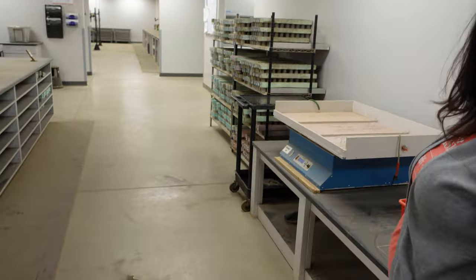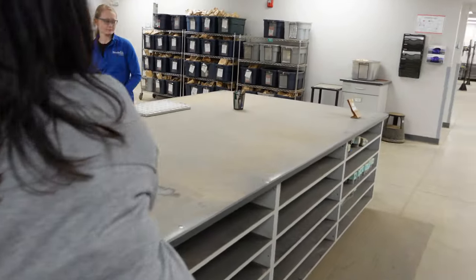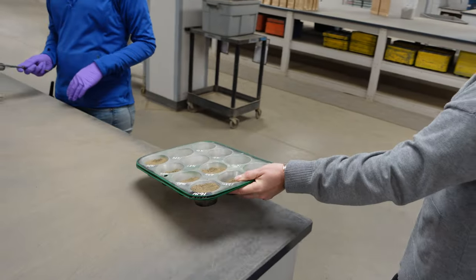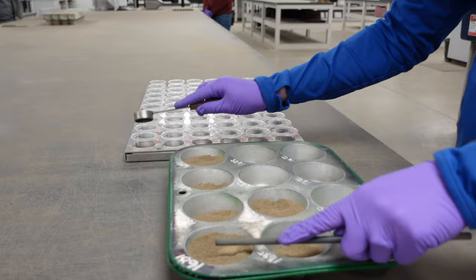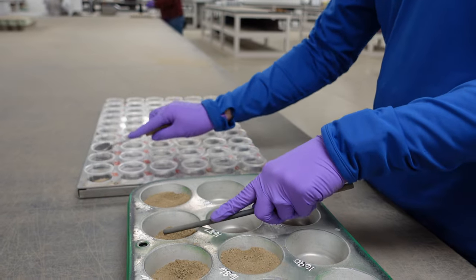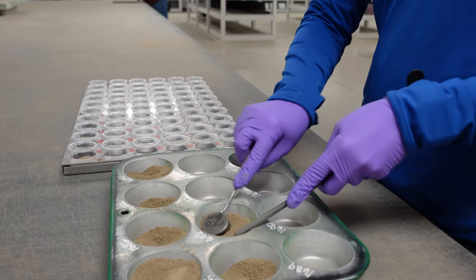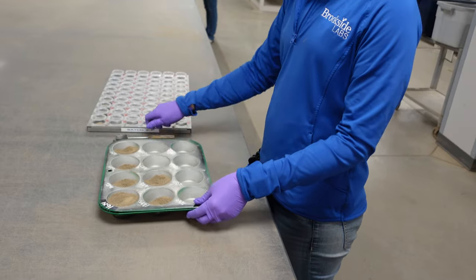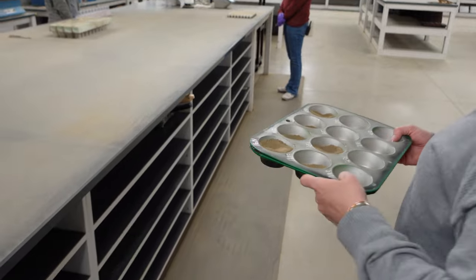We would also have scoops for organic matter and for pH. The muffin tin continues around. We're going to scoop for pH, which is a one-to-one ratio — seven grams of soil placed into the designated cup. We will eventually add seven mLs of DI water, stir the sample, let it rest, and then test the sample on our robots. One of these happens to be a quality control check, but at this point nobody knows which one is which — you just know it by number.